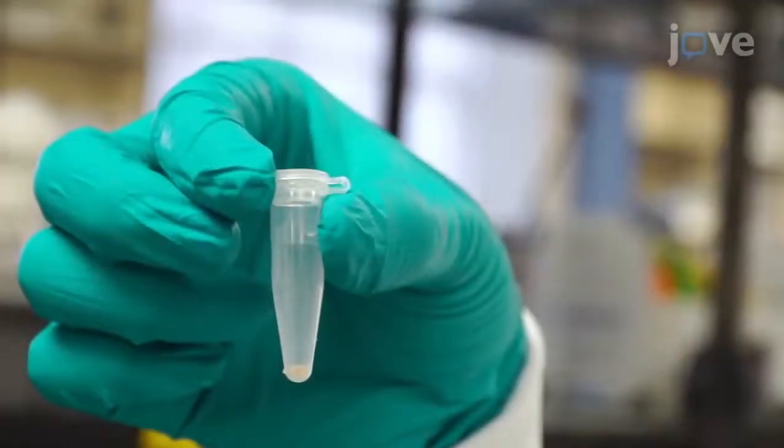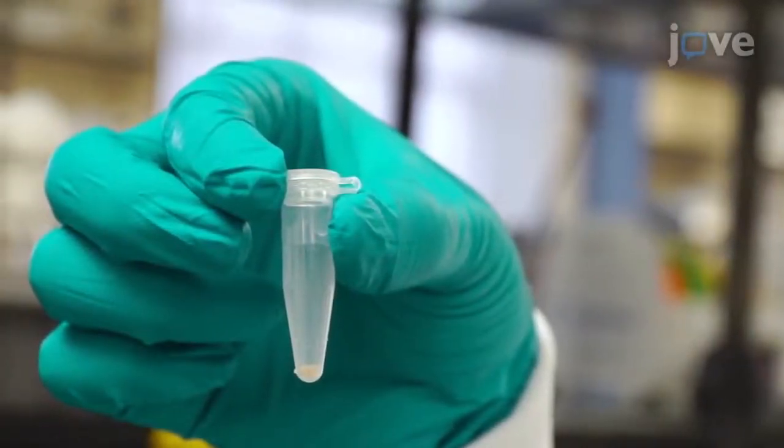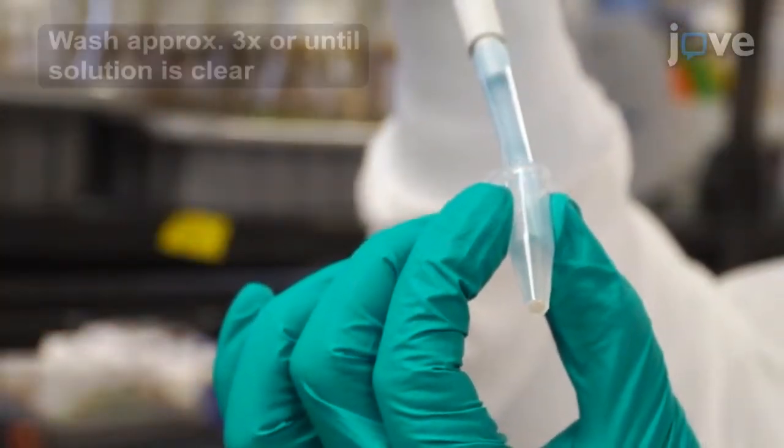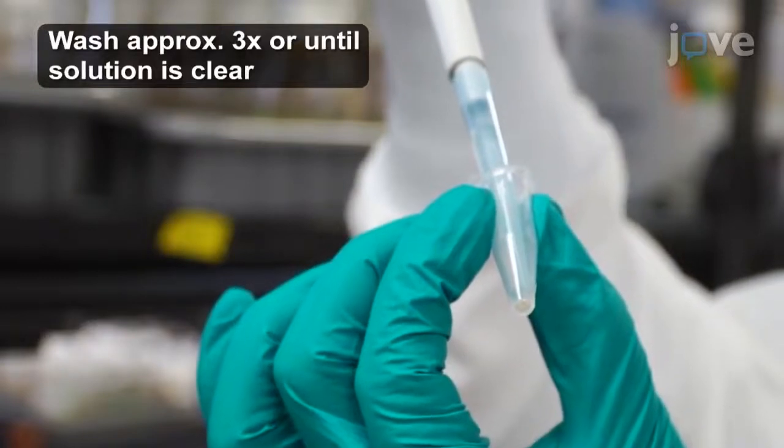The larvae will sink to the bottom of the tube, but the yeast will remain in suspension. Once all larvae have formed a loose pellet, remove the sodium chloride solution using a 1-milliliter pipette.